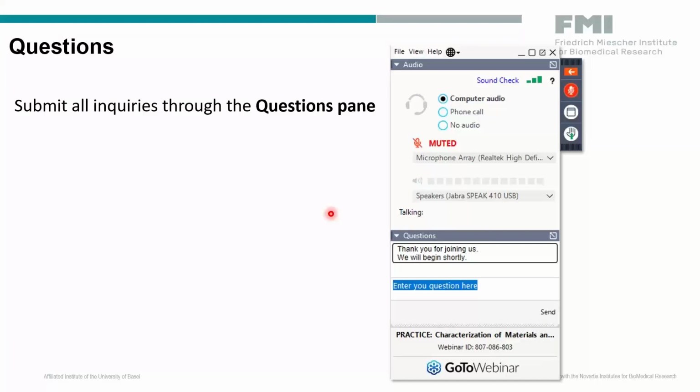First of all, what's the biggest limitation of serial block face SEM technique? One, I would say, but which is not a bottleneck for us, it's maybe to achieve lower resolution in Z, meaning cutting slices of lower than 25 nanometer. But I think now more people are developing some ways to overcome this limitation.